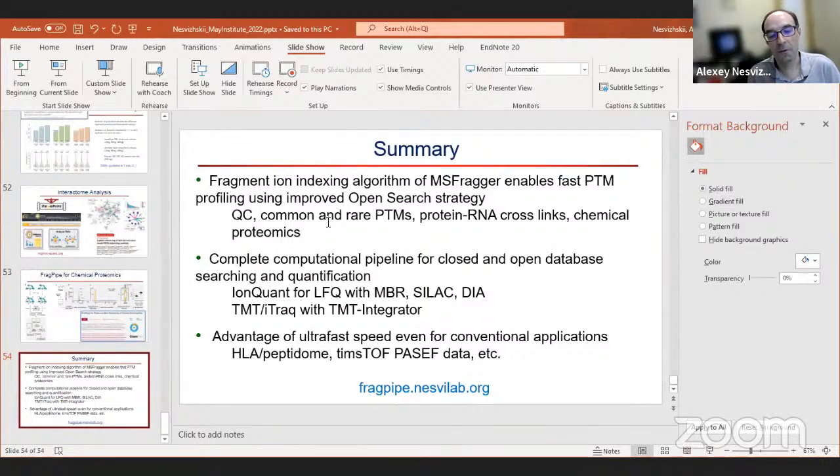Some of that, of course, is post-translational modifications too. You do see phosphorylation and ubiquitination, even in single cell data. Not a whole lot, because of course you're not starting with a lot of material. But we see some interesting artifacts, because single cell workflows like nanoPOTS require different types of materials and different tubing. So we see some polymer contamination, for example, that you would not necessarily see in a traditional workflow.